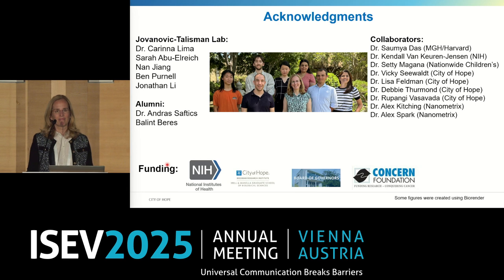Quick question regarding the challenges with the EV count. Over the last 10 years, I used NTA, NanoView, NanoFCM, ZetaView, you name it. And I can tell you, if you have one sample counted right now, you're going to get four numbers. And if you count it 3 times, you're going to have 12 numbers. So my question is, what is your favorite way of counting the vesicles? Let's say you want to do an assay, you need 1 billion. What is your way, or what combination of methods do you like to use, to have an accurate number to count EVs?